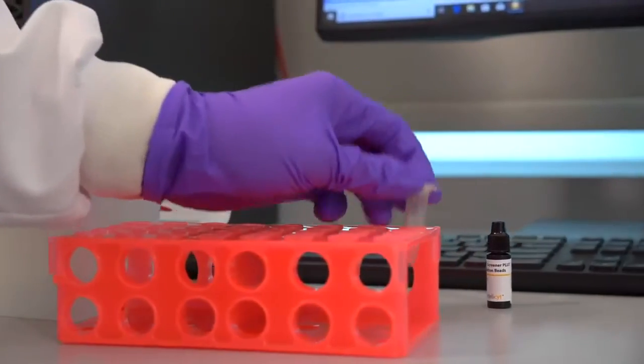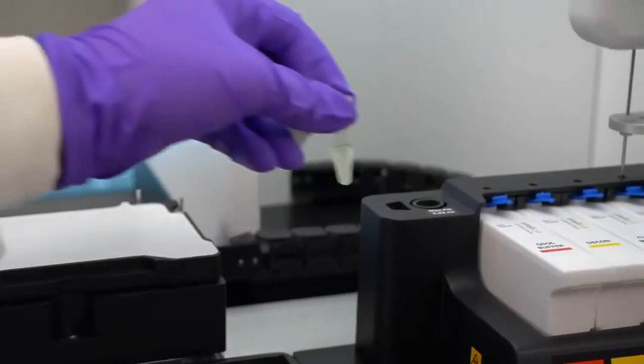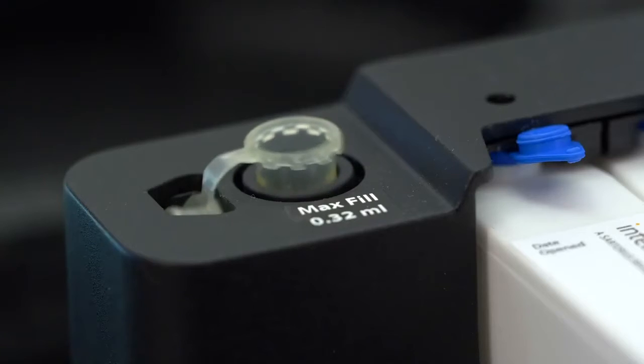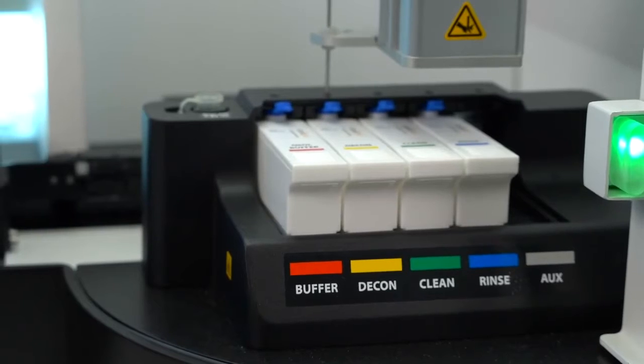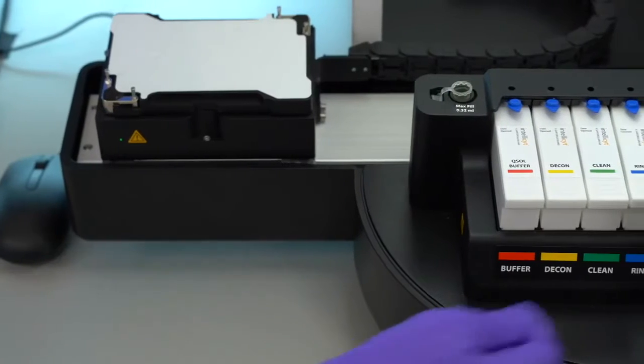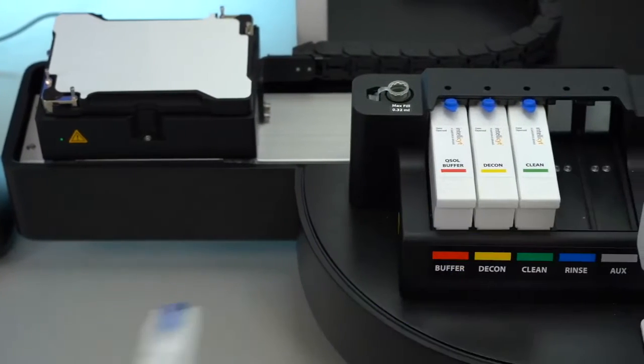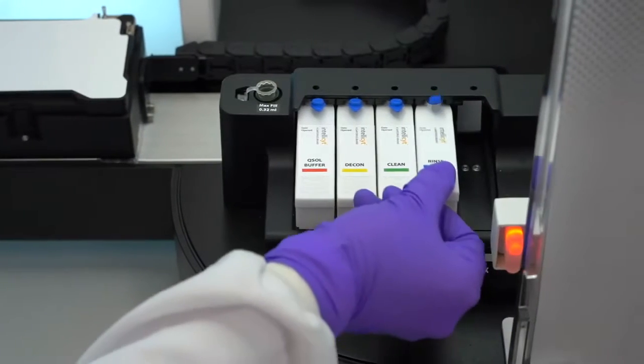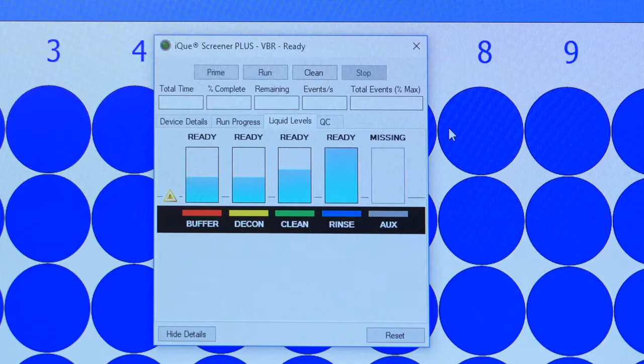The IQ3 has been designed with ease of use in mind, including automated QC with onboard vortexing to ensure proper resuspension just prior to sampling. Built-in rinse station, liquid level detection, and user-definable rinsing and shaking protocols ensure reliable sample processing for complete peace of mind.